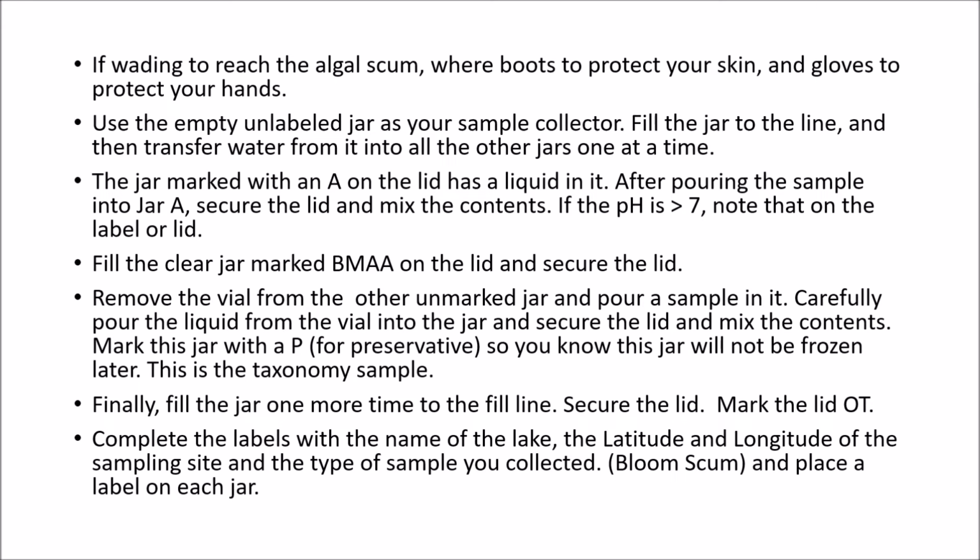Thank you. So here's a clear jar. Again, there's a line on it. And at the top, it's labeled BMAA. You're going to open that jar and put a sample up to the line in there. Close the lid. No other information, nothing else you have to do with that. Then the jar.